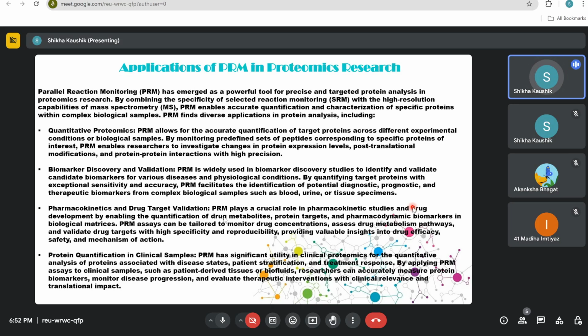तो क्या हो रहा है, आप खुद सोचो, हम पहले पढ़ रहे थे अपना whole proteome. अभी तक when we were not doing any kind of a complexity reduction, we were studying the entire proteome. तब हमारे लिए बहुत difficult था to say that it is an accurate quantification or it is a highly resolved spectra, because we have lot many things there.